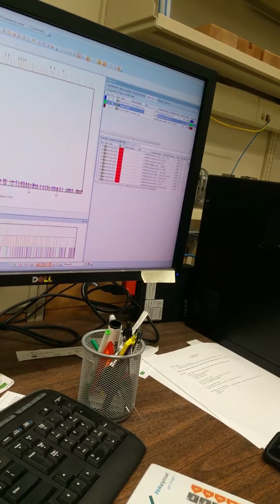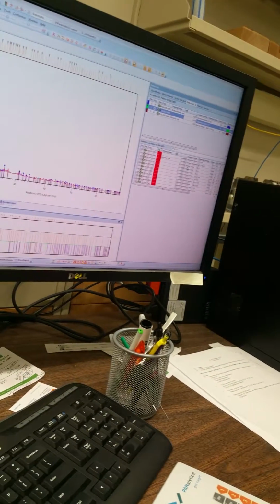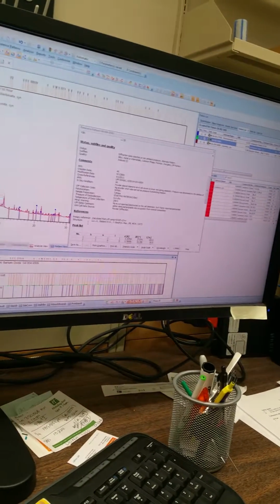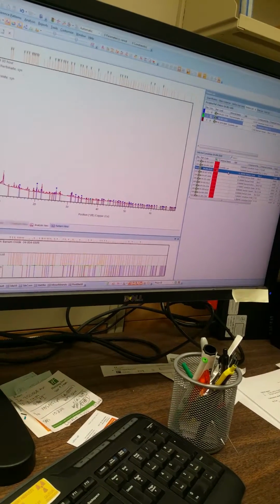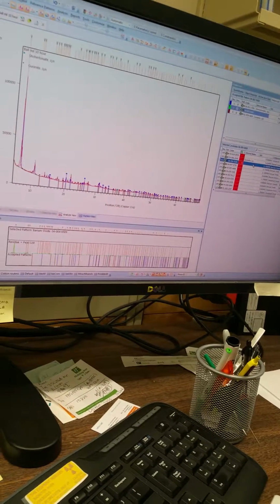So basically it gives you a big list of materials. They get this data from different references, like publications. If you double click on any of them, that's the publication. So you should go through them, mix and match them, until you fit all the peaks that you have.